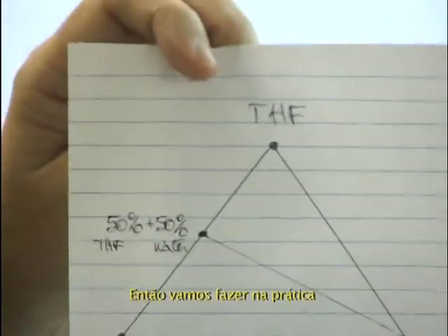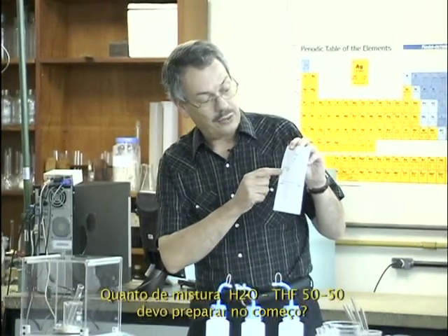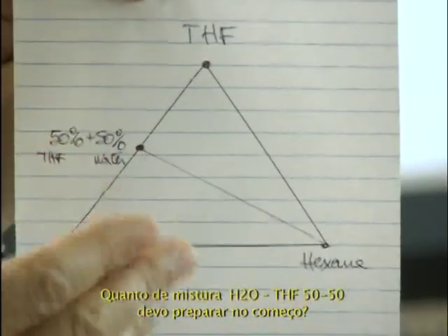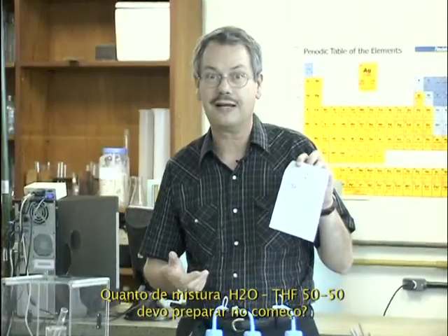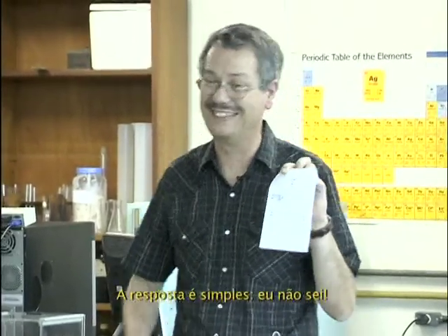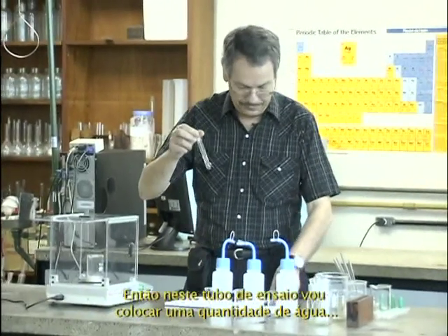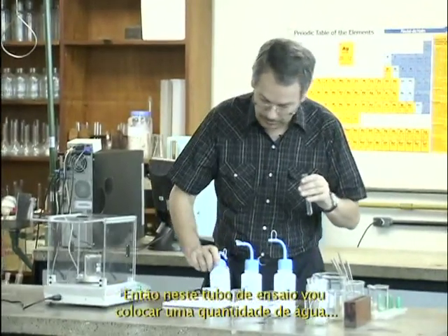Okay, so let's do it practically. How much water-THF mixture 50-50 should I prepare at the beginning? The answer is simple, I don't know. Good. So in this test tube, I will put a certain amount of water.